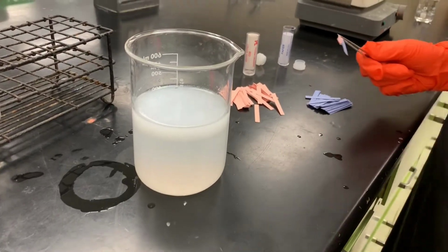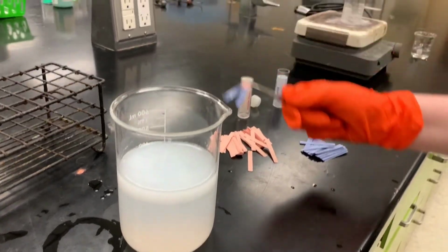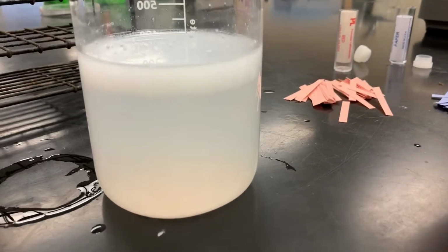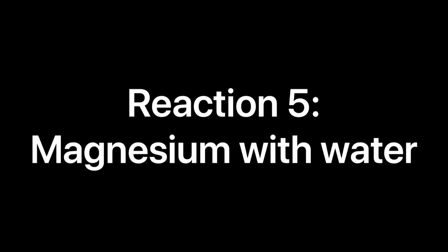After the reaction with calcium and water, let's just test the product here. Okay, and again, we're getting blue litmus paper, and we notice that this is white. It's like I've got a precipitate there as well.